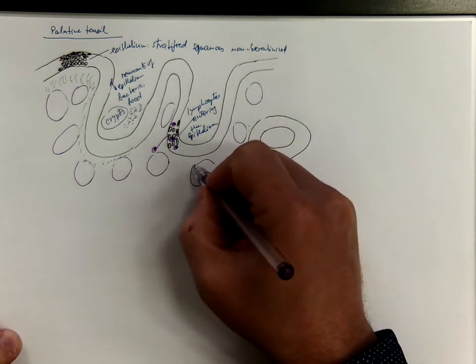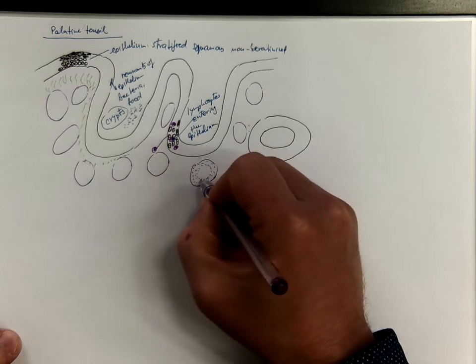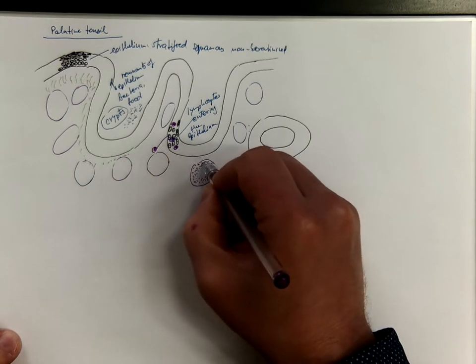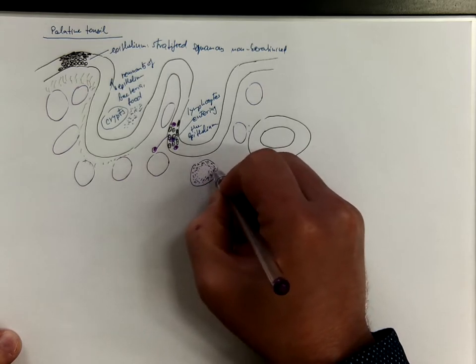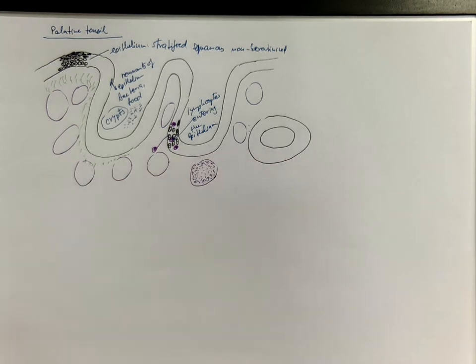These follicles have a mantle zone and those that are activated and the immune response is occurring right now, they have a more pale germinal center.